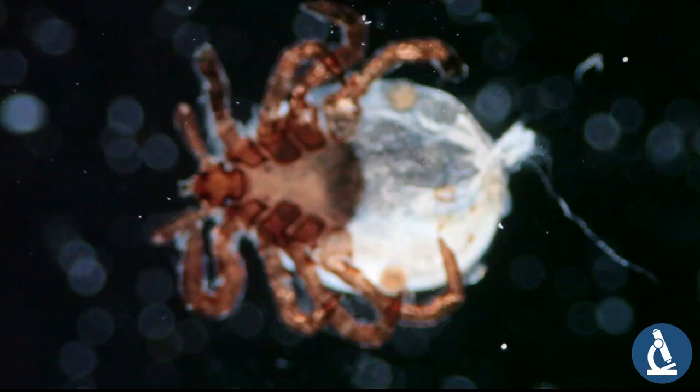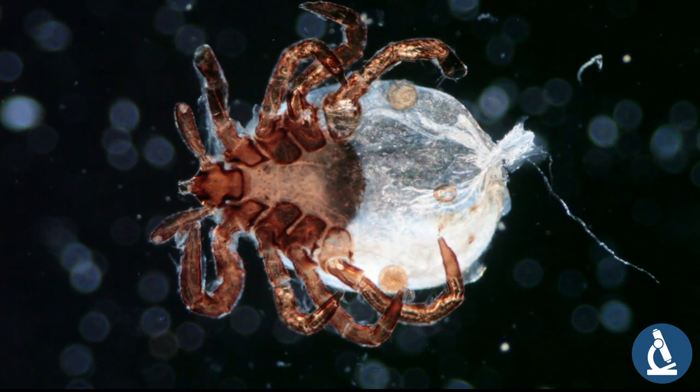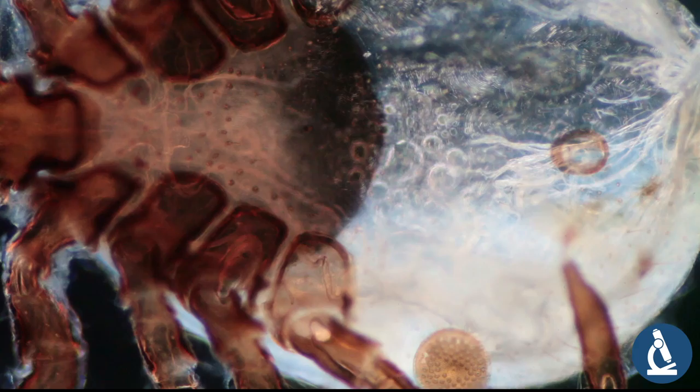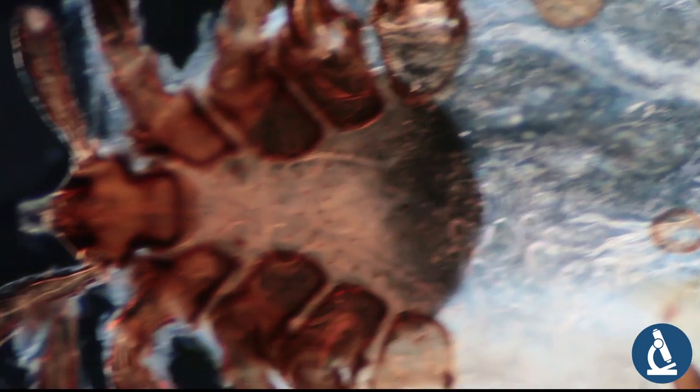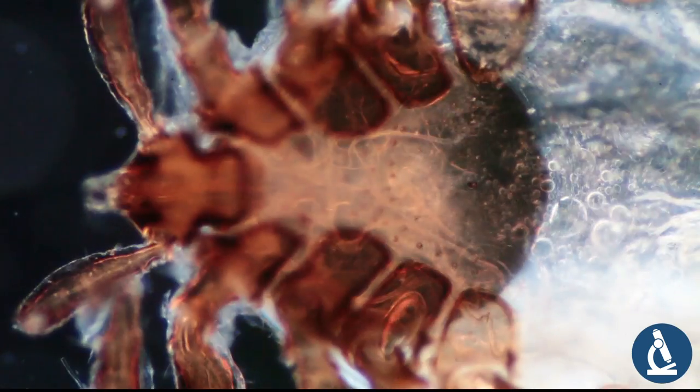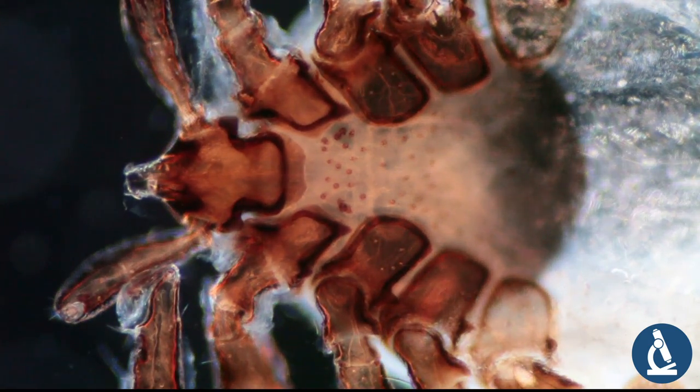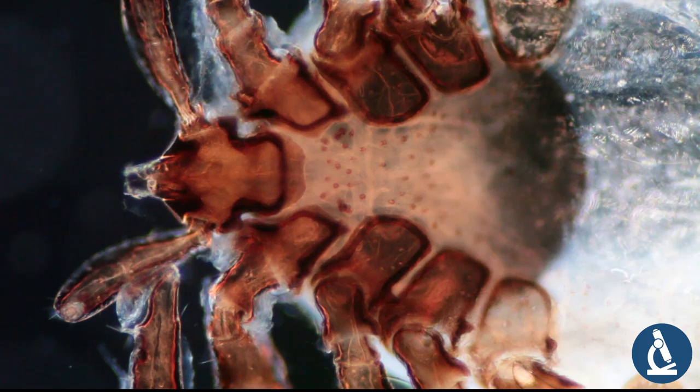That's me using the microscope. In dark field it looks like this, and you can see that the tick actually looks a little bit transparent. It has basically a semi-transparent body. I'm now using the 10 times magnifying objective, and I'm focusing in and out so that I can see the different layers of the tick's body in focus.